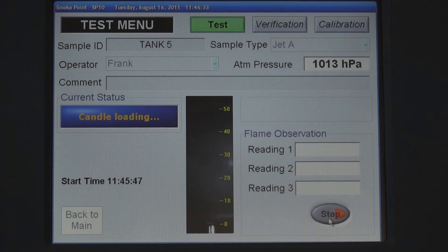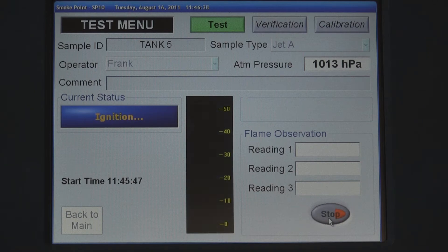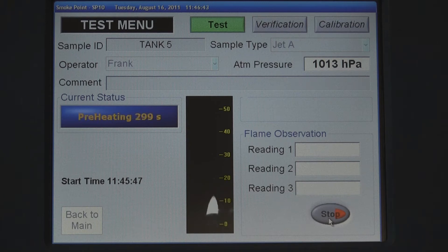A glow plug automatically lights the wick. The sample flame will then preheat for 300 seconds.